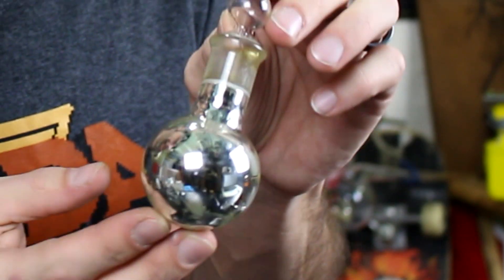The dextrose causes those silver ions to precipitate out of the solution and actually form solid silver metal on the inside, which then sticks to the surface of the glass and boom, we have a nice mirror flask.